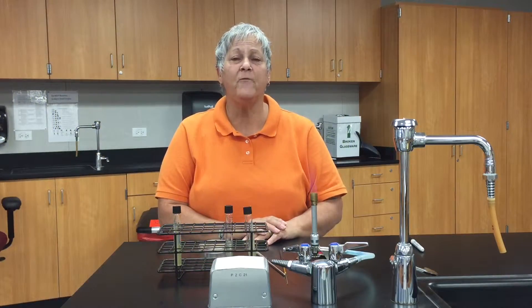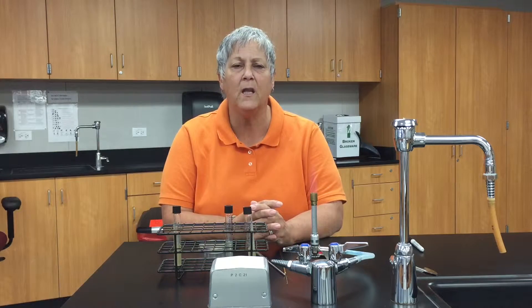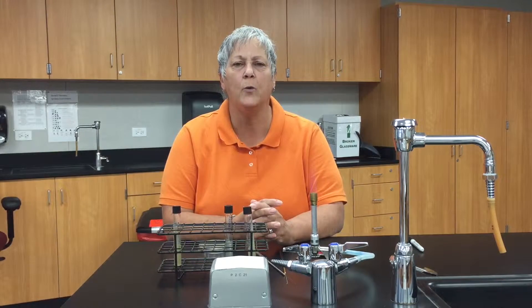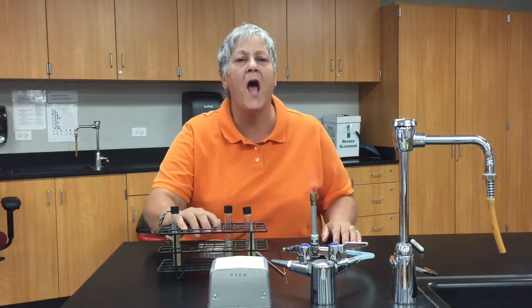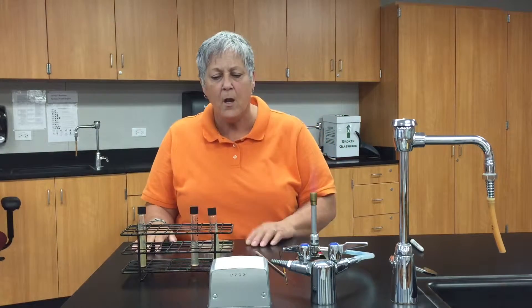Hi micro students, this is Professor Schimold and I'd like to show you how to inoculate motility media to test for bacterial motility, and also how to inoculate a TSA plate to test for swarming. I am not using any live bacteria in this demonstration, that's why I don't have a coat or gloves on. Let's talk about motility media first.